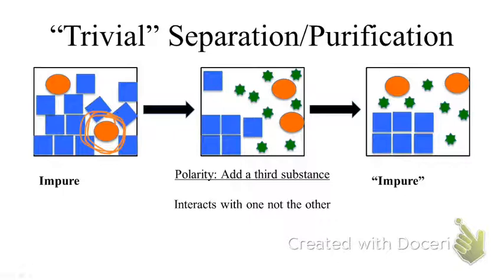We'd have to break the intermolecular forces holding those sand particles together. So we could try and shake it up. That can help. We could try and grind it. We could still try and stir. What we're trying to do is maximize the surface area. But if that salt particle is literally locked within a sand sphere, it doesn't matter how much we grind or shake or stir, it's not coming out of there.